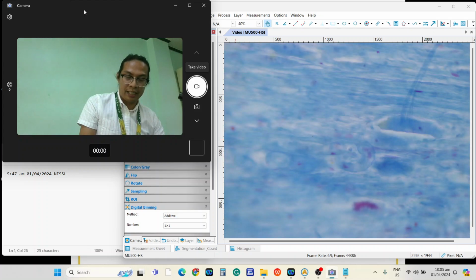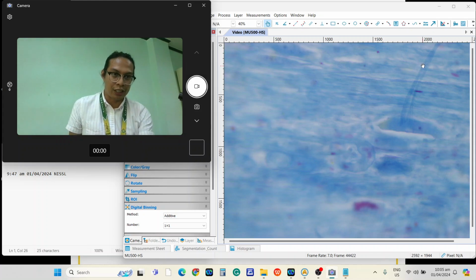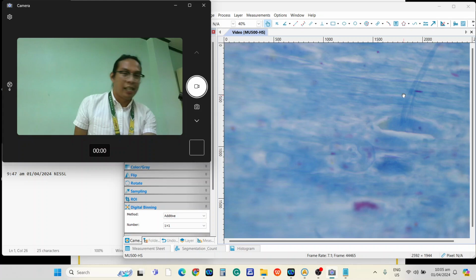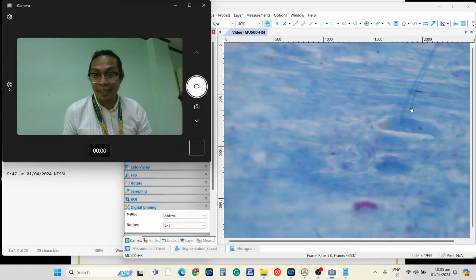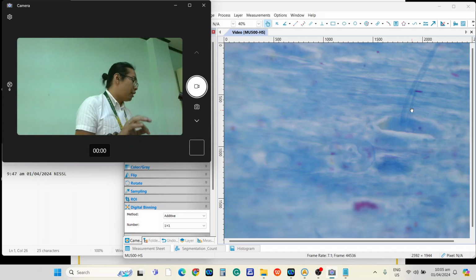So that is the Schmidt-Lanterman incisures, such as that one. Okay, so that is a Schmidt-Lanterman incisure. Okay, diba? So makikita natin yan sa isa dito sa sympathetic trunk ganglion na slide. Okay, so those are the neuron, the neuroglia, and the spinal ganglion.